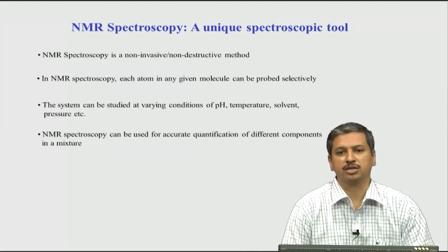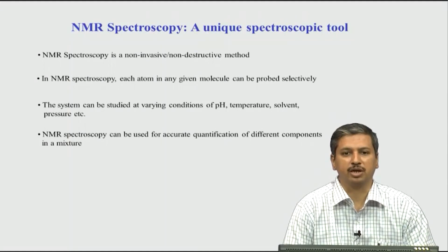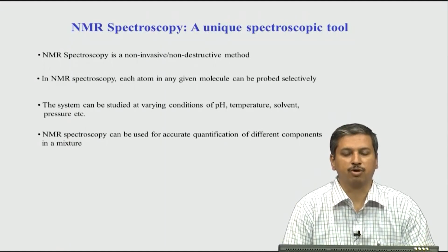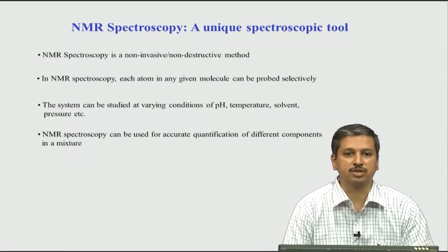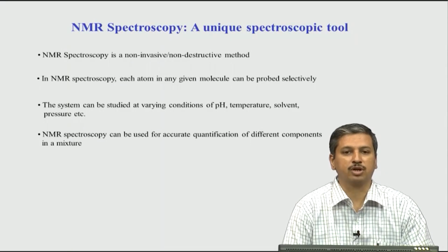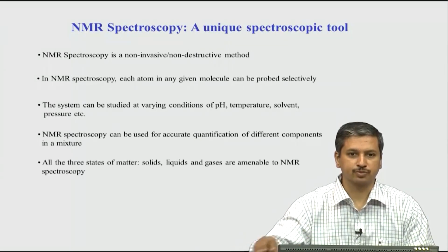The next very important point is that NMR spectroscopy is a very quantitative technique. So, you can quantify the amount of sample present in your study. This differs from many other techniques. Because we do not destroy the sample, it is a non-destructive method, you can preserve the quantification and measure the amount of the sample present, and this is very useful for many applications. For example, in metabolomics, where we look at the quantity of sample in a given mixture, you would like to know the relative amounts present, and this is where NMR spectroscopy is very useful and stands out as unique among other techniques.